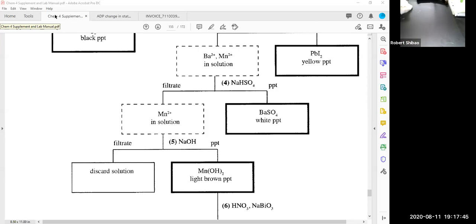All right, what time is it? 12:17. So it's enough time to run one more, and so I'll make up one more unknown. But before I do that, this is what I have the students do in Chem 1B. I should have done that before I started.